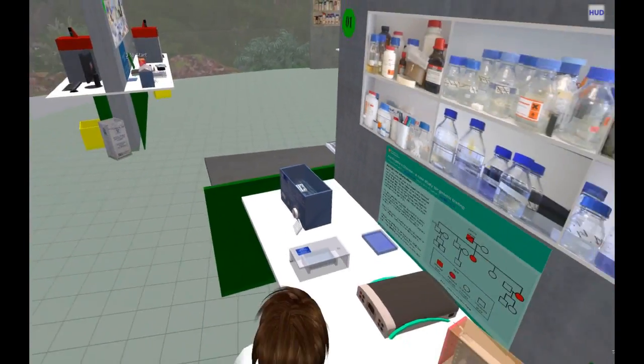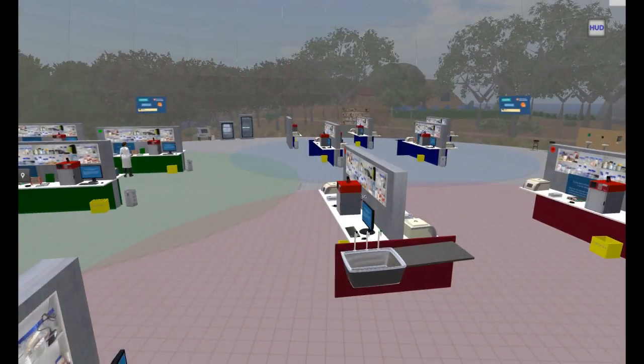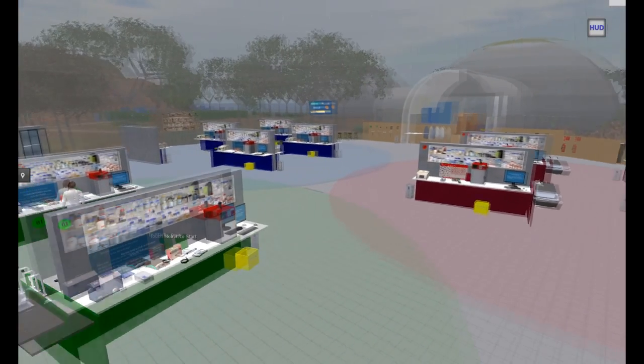The SWIFT project at the University of Leicester created a virtual genetics lab, where students can experience the process of genetic testing.